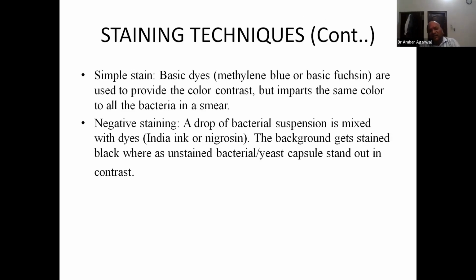Now, staining techniques. It can be a simple stain or a negative stain. In simple stain, basic dyes are used to provide color contrast, but impart the same color to all the bacteria. So it is not that frequently used.